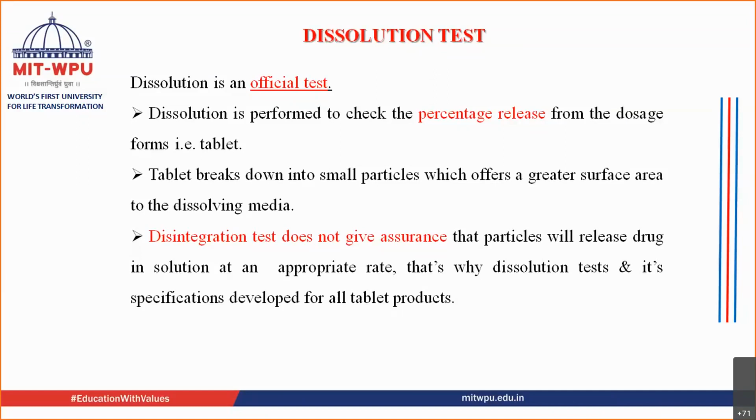This dissolution test also mimics the conditions that are happening inside the stomach. It is an in vitro test, but it gives you an idea of how much drug is getting dissolved. If you remember, one of the differences that I told you between solubility and dissolution is that dissolution is with respect to something. It may be with respect to time, temperature, or pH.